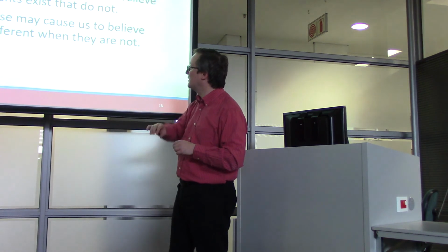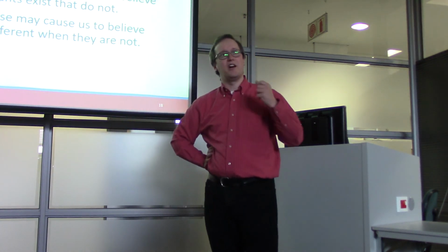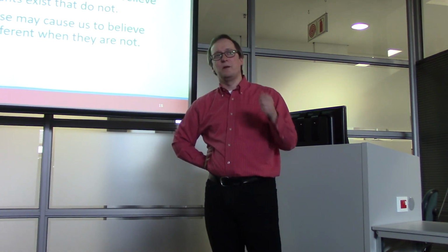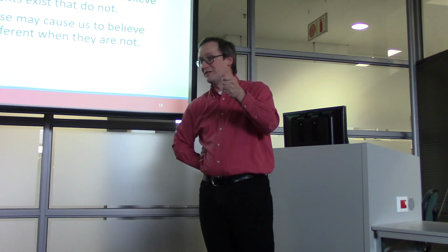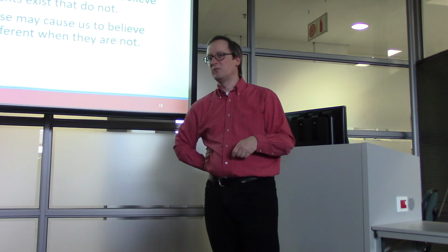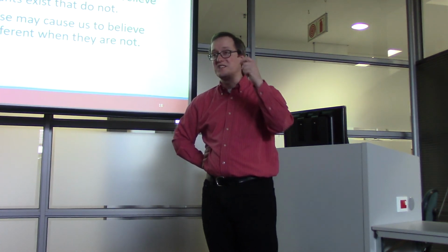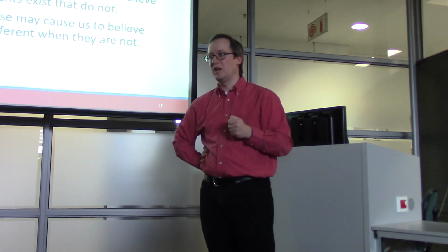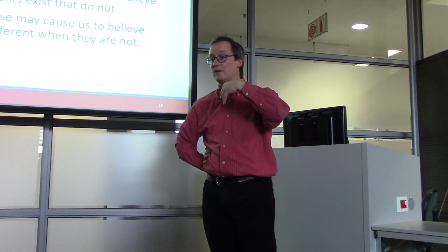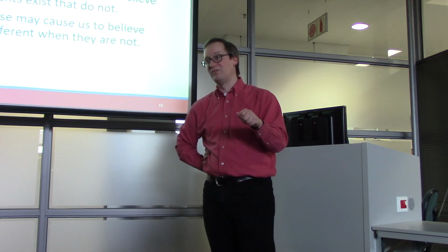It may cause us to believe cohorts are different when they are not. And the experiment that I always end up proposing to people is a highly conservative one. Mix together some reference sample, a whole bunch of it, and then run it through the same sequencing technology multiple times. Sequence the same sample 5 times, for example, and ask, how much variation do I see among the reads that I get from these different experiments with exactly the same sample?